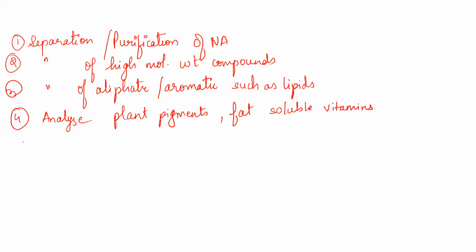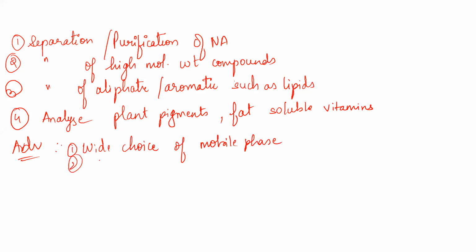Advantages are, again, a wide range of mobile phases. So you can say a wide choice of mobile phase for separation. Second, complex sample mix can be readily separated.